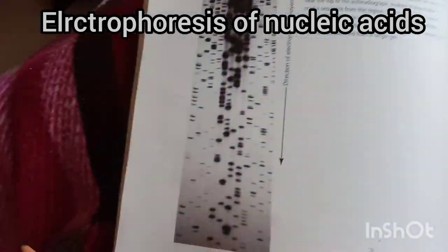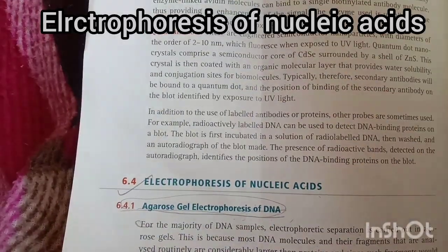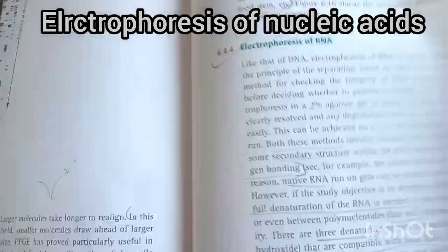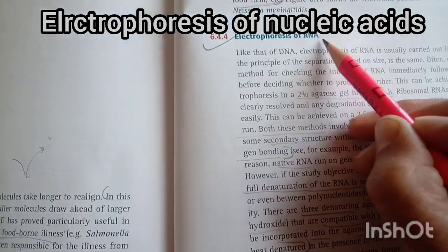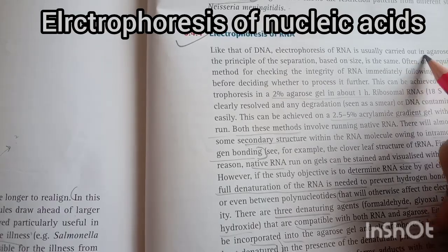So this is all about the gel electrophoresis of nucleic acid. Firstly we covered DNA. Next we are studying RNA, which will be a very short topic. Electrophoresis of RNA, like that of DNA, is usually carried out in agarose gel.